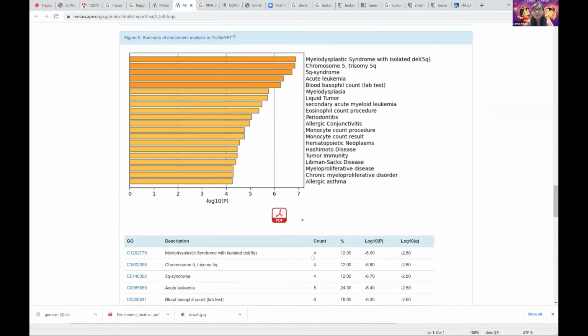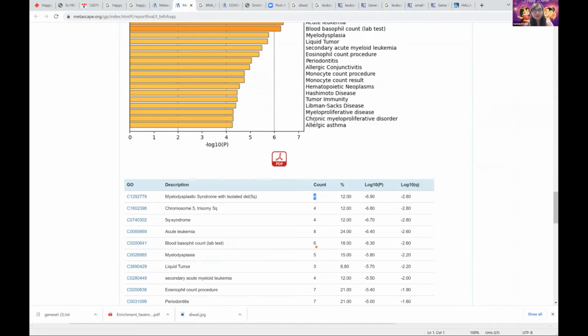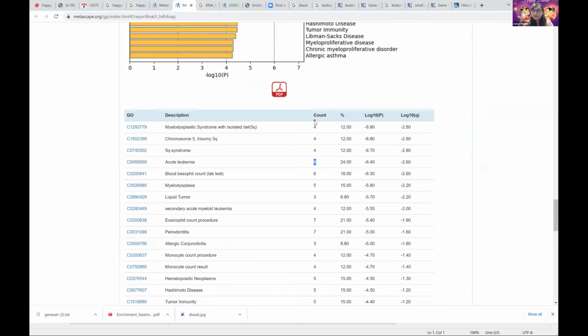And even if there are more counts found, you might wonder why this 8 doesn't go above that one. The reason is, what if your gene list is smaller? So we have our 34 here. And what if we're comparing it to a gene list that is kind of small, like biology list one, which has just 20 genes?